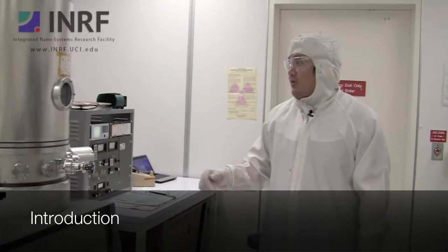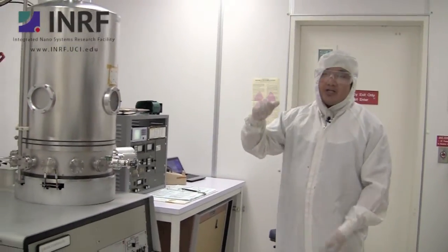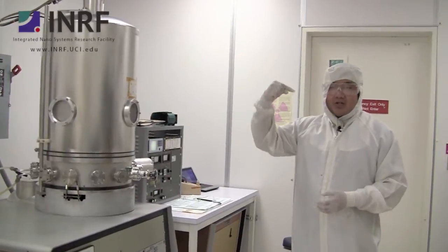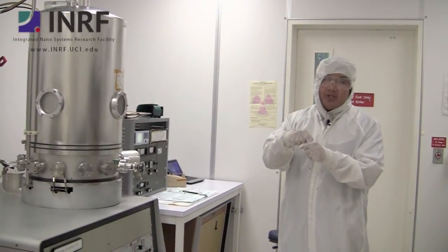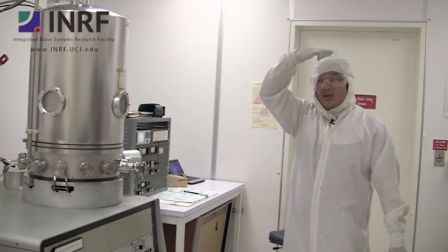This is the E-beam. It is used to deposit metal or even silicon dioxide onto your substrate. What it does is it uses an electron gun to heat your sample material and that will evaporate onto your substrate in your sample up here.